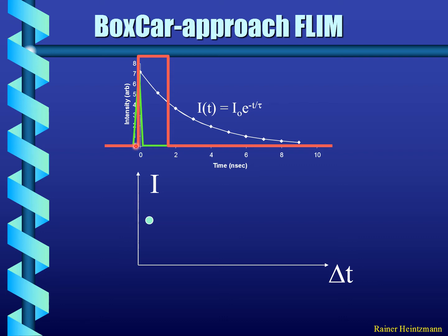You can, for example, have a multi-channel plate where you can have some high voltage, and with some complicated electronics, you can very quickly turn up the high voltage and also turn it down again. And if you manage to do that quickly enough, within a time scale of less than a nanosecond or in the range of nanoseconds, you can measure by repeating this experiment. You do a pulse excitation followed by a gated detection. This way you average over multiple measurements. Typically, you get an average of the brightness.